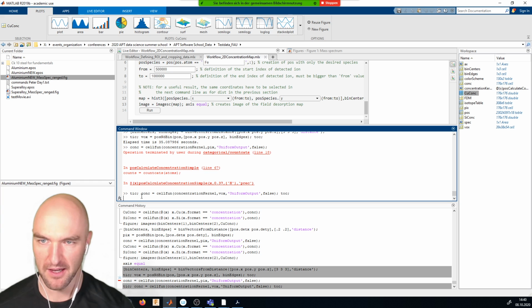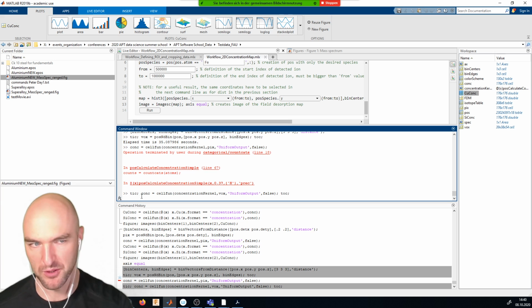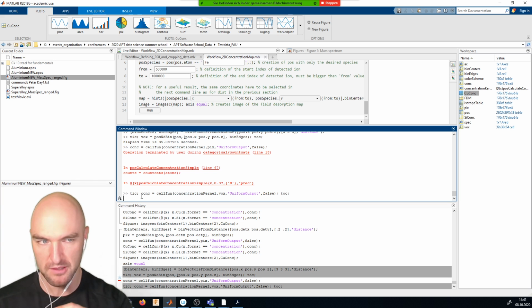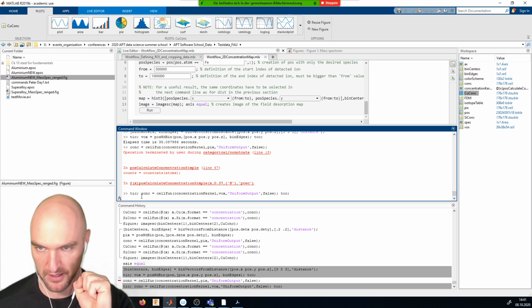one thing that is very easy that we can do is to just voxelize the individual atomic sub-pos files. Yeah, so to just get a count per voxel for each of the species. So I'll just say, okay, give me all the counts for copper and give me all the counts for all of the atoms.